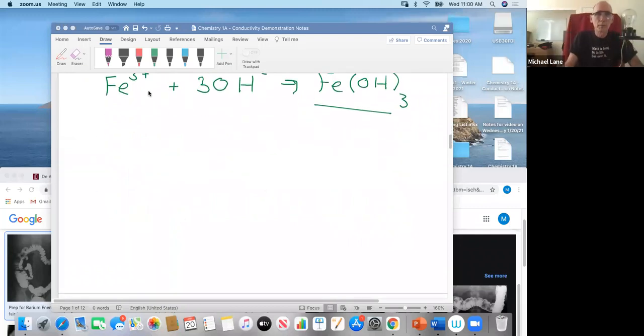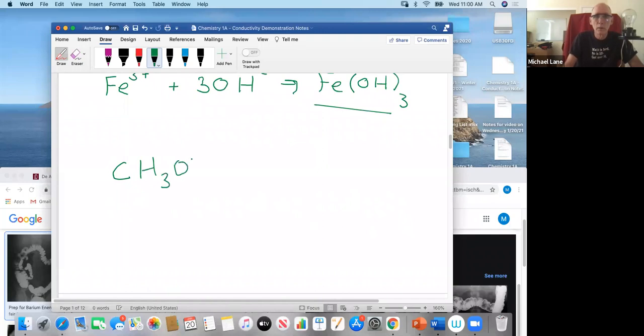So the first was methanol. It is this formula. Now, we will get into Lewis structures and molecular formulas later in more detail. For right now, it is not critical that you understand this, but these bonds that I'm showing, these lines, represent covalent bonds, right? We've talked about ionic bonds. These lines represent covalent bonds where the electrons are shared.